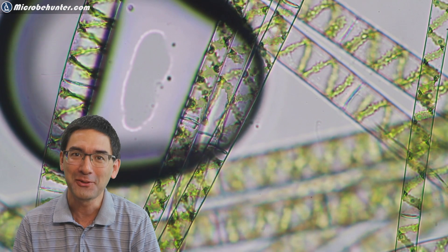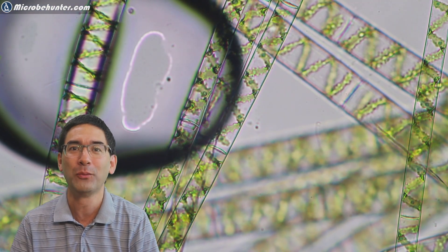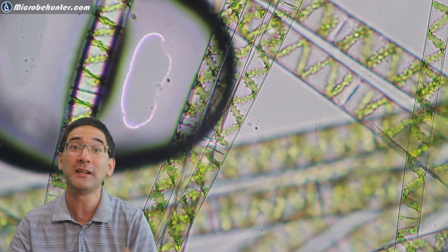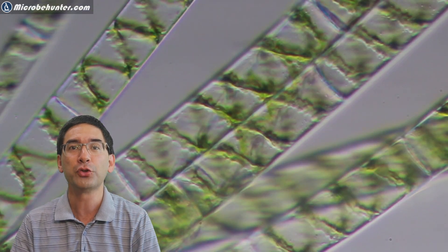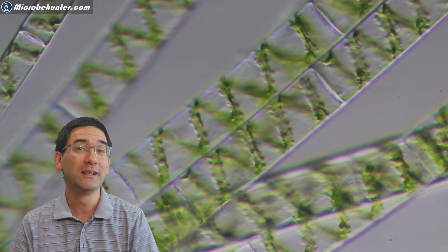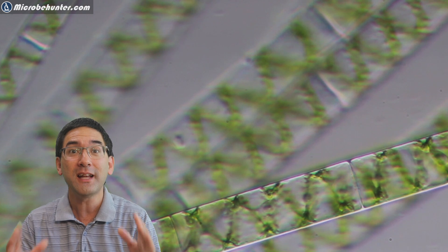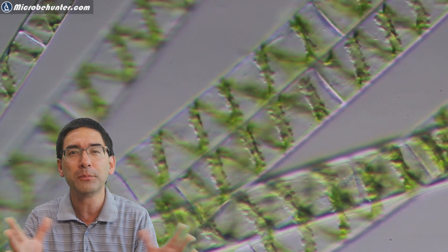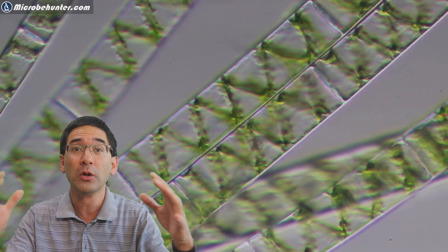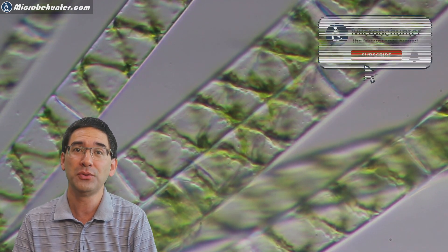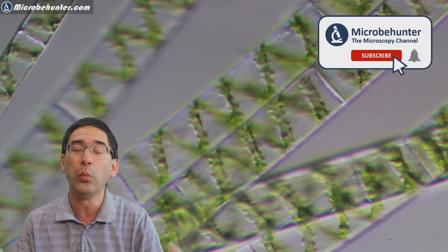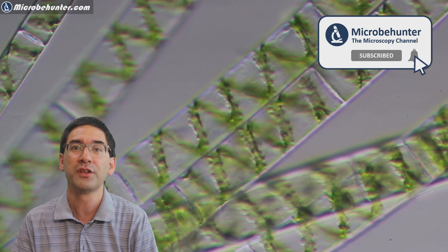Hello and welcome, Microbe Hunter here again. Today I'll put another water sample under the microscope and specifically I want to talk about the production of oxygen because I did a little bit of research and I found out that at least half of the oxygen, some researchers even think up to 70 to 80 percent of the world's oxygen is produced by algae in water, specifically of course the oceans.